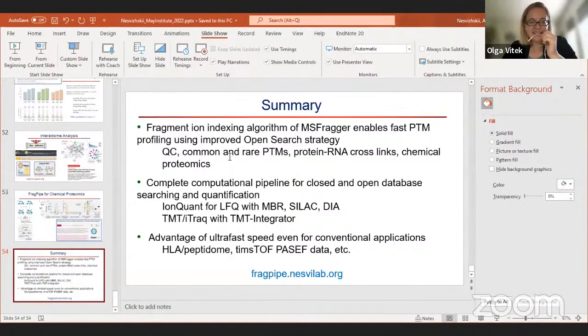Sounds great. And along similar lines, how reliable is DIA for identification of PTMs, in particular for weak ions in the phosphopeptides and mixed spectra, given that we have a wider isolation window?